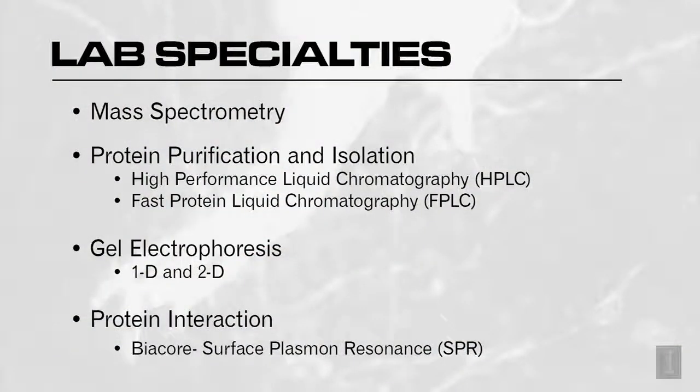There is also a small component of the protein science where we study protein-protein interaction using an instrument called Biacore. This Biacore uses the principle of surface plasmon resonance, SPR, in analyzing protein-protein interactions. So SPR is something that we also do for protein interactions.